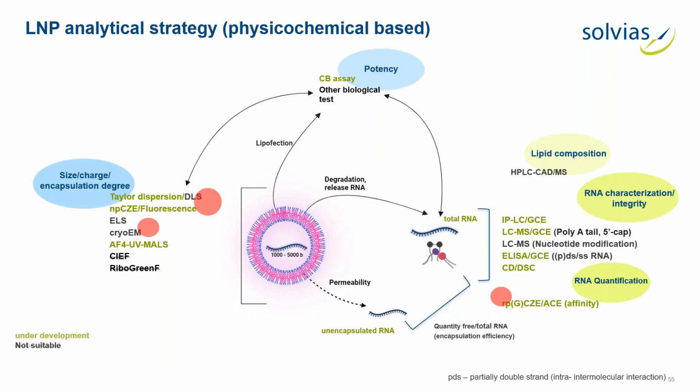So this is why we developed here in-house a strategy that covers the selected criteria. On the left side, only a few techniques are available at the moment, focusing on the intact particle system.